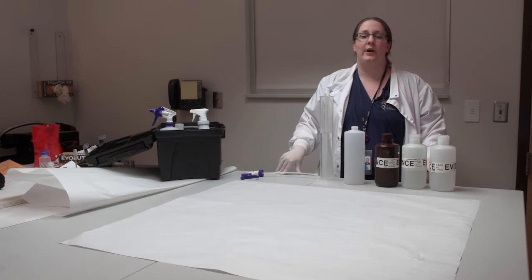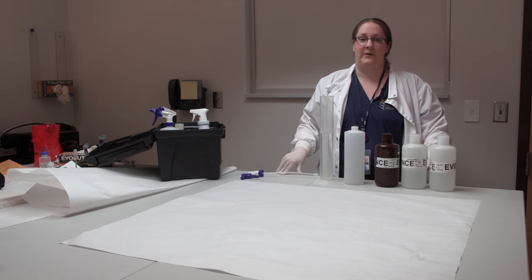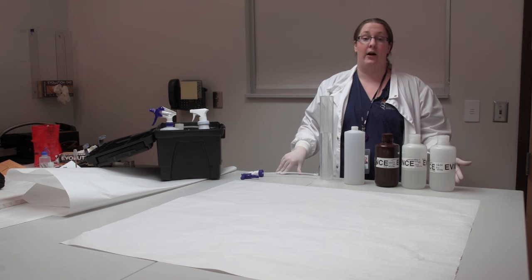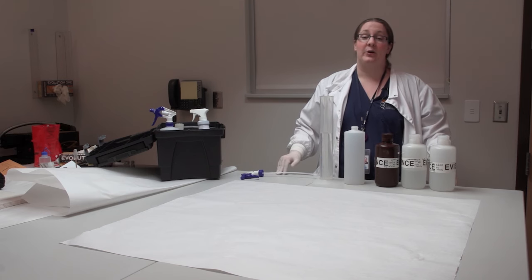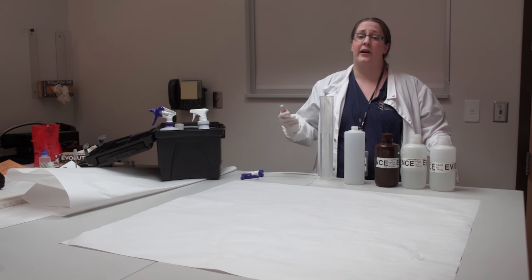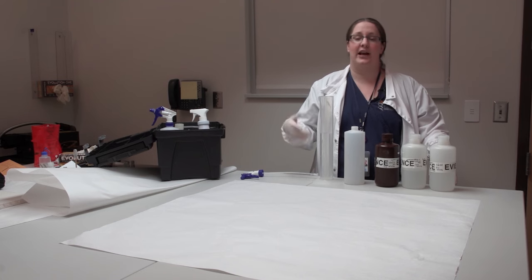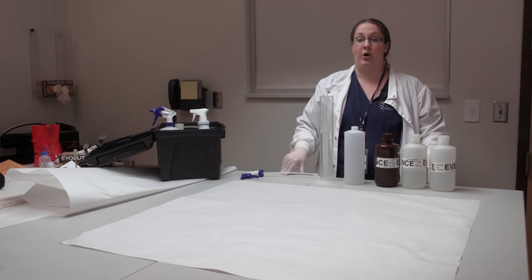Sometimes when we're out at a crime scene looking for blood, we don't get those nice dark red-brown stains that are easy to see - either from somebody that has cleaned up the crime scene, or you just get really diluted stains. Or you might be in an area like an office building where the carpet is really hiding those stains. There are times when we're looking for blood that we can't really see it with our naked eye very well, or we're searching for patterns such as footprints leading somewhere. In that case, we're going to use a chemical called luminol.